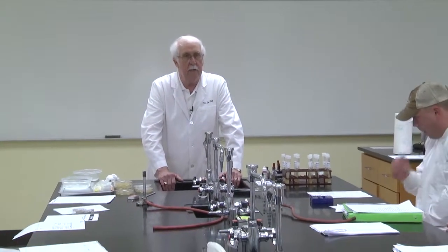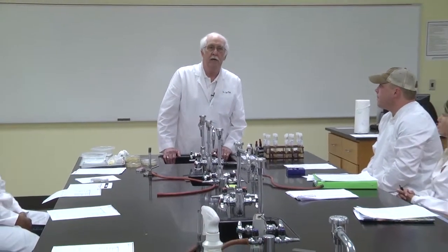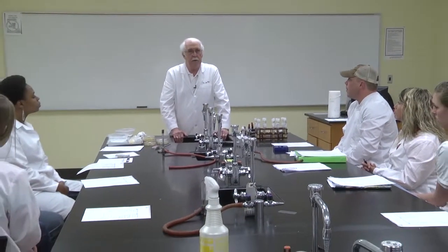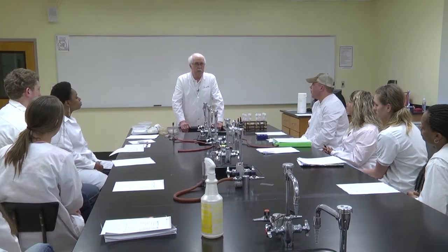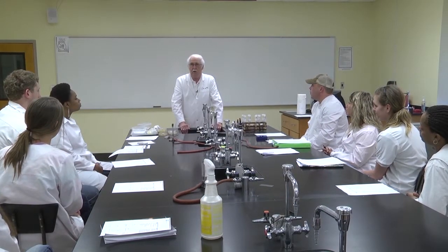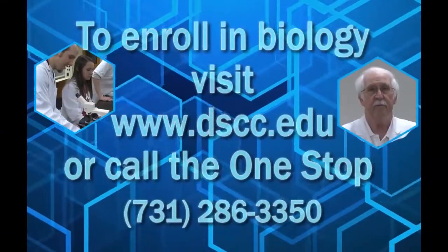This will be coming up again. Later we'll be doing unknowns, and this will be the first step among many steps. This only determines the morphological characteristics. We would follow this up with biochemical characteristics.